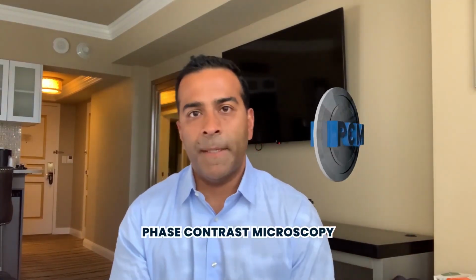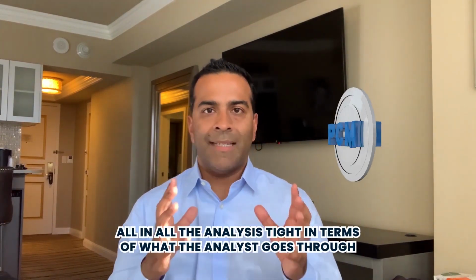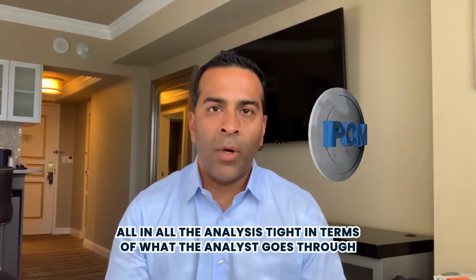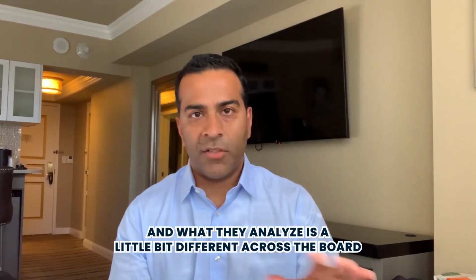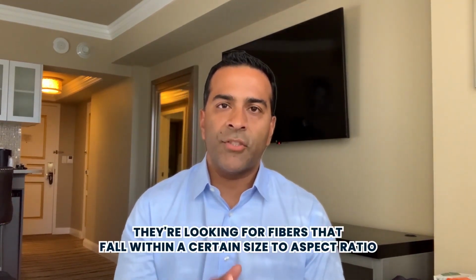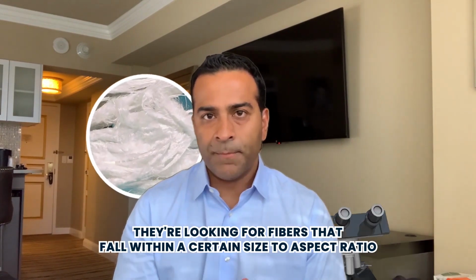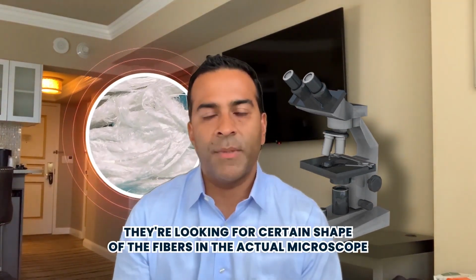Now, the other method, the PCM method, phase contrast microscopy, is also sampled in a similar manner with a slightly different cassette. All in all, the analysis, in terms of what the analyst goes through and what they analyze, is a little bit different across the board. As a result, they're not identifying asbestos fibers exactly. They're looking for fibers that fall within a certain size to aspect ratio. They're looking for a certain shape of the fibers in the actual microscope that they're looking at.